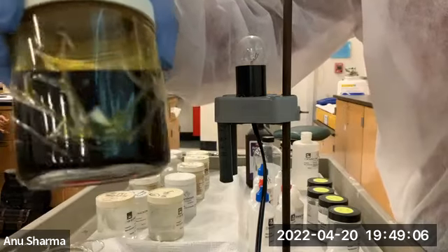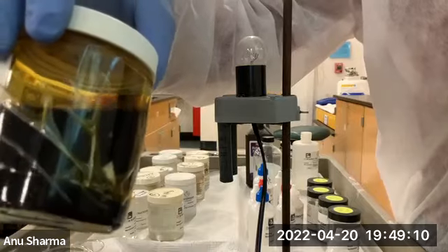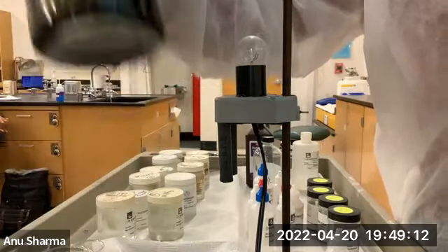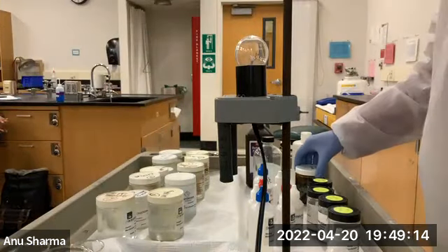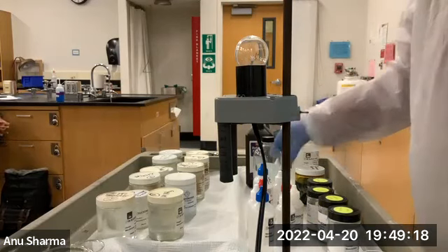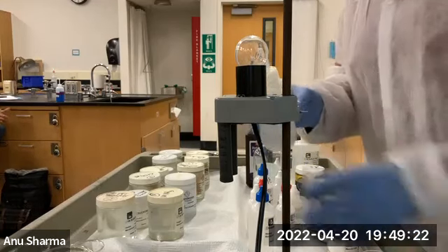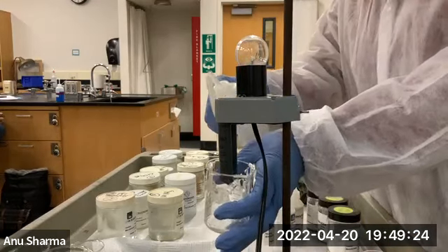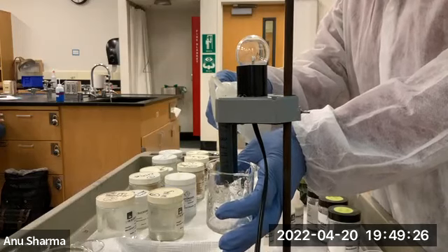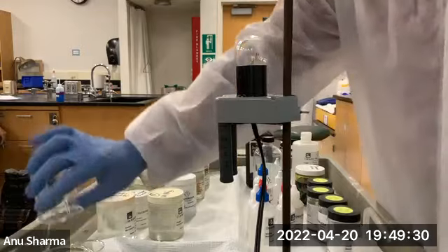But anyways, this is your iodine dissolved in something, and these are used in doctor's offices and so forth. So here is this tincture of iodine. What do you guys think of tincture of iodine? Will it be soluble in water? Will it conduct electricity? Let's see.